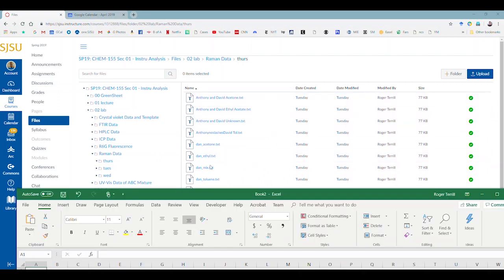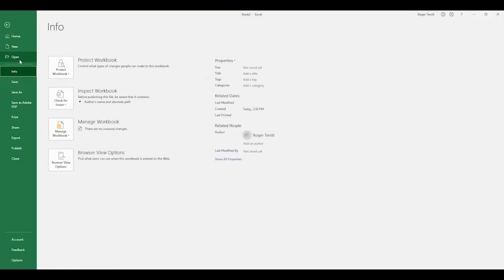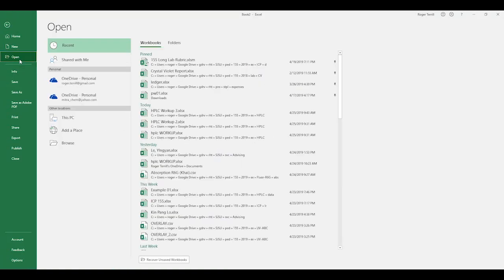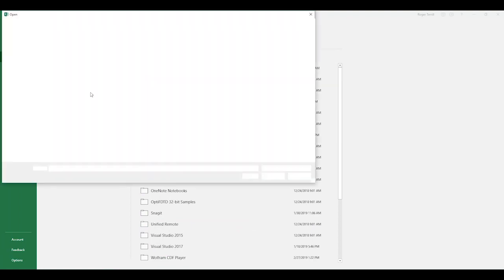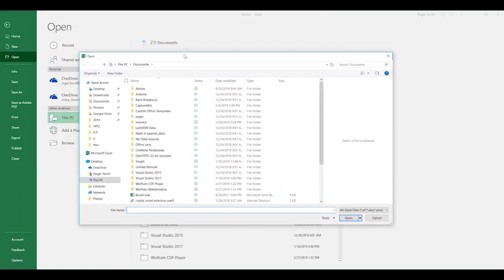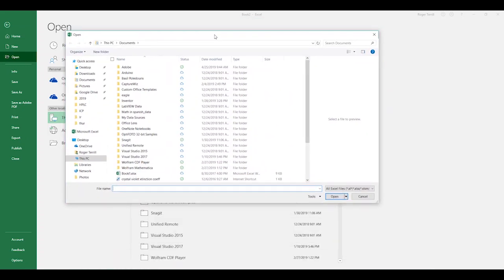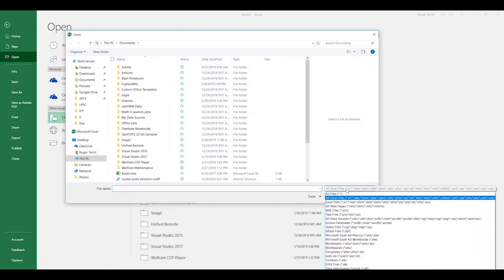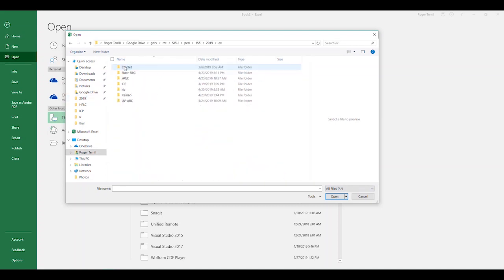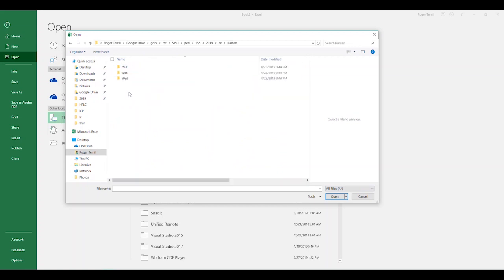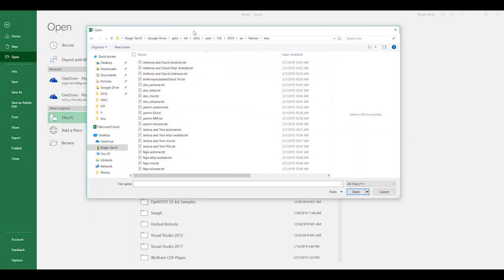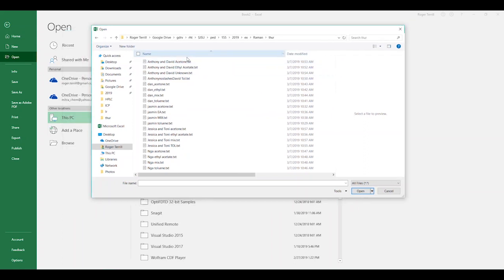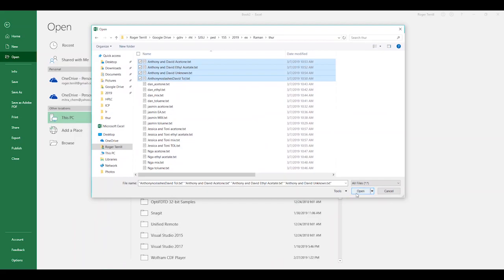So I'm going to locate them on my hard drive. File open, and what I need to do is I need to get a normal Windows type dialog to open the files because these Office dialogs don't work very well. When you get this type of dialog, go to all files so it will show you all the files. I happen to have mine in this format and the ones on Canvas are .txt files so I'm gonna try group downloading them and see how that works.